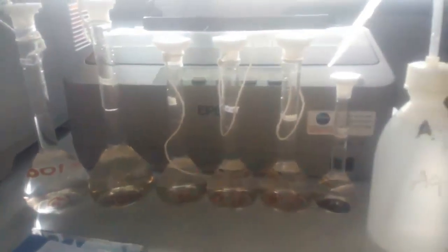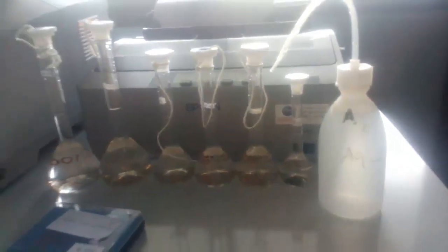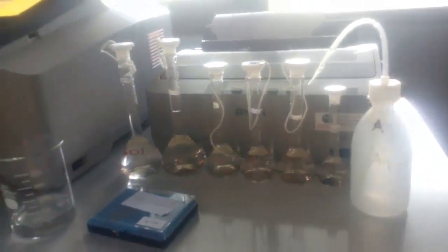These are the materials that we'll need to determine chloramphenicol with UV spectrophotometry. And we use a double beam UV spectrophotometer.